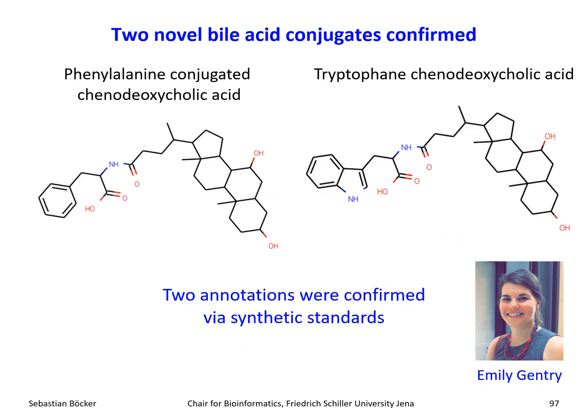And luckily, we had synthetic standards available for two of them. And that is due to Emily Gentry, who synthesized those and then made sure those synthesized are indeed the structures that we are looking at. So we could confirm those annotations by those synthetic standards, which still does not mean that we are 100% sure it's this structure, but again, as sure as retention time and tandem mass spectrum can get you.